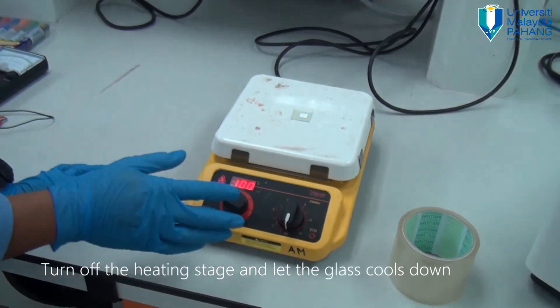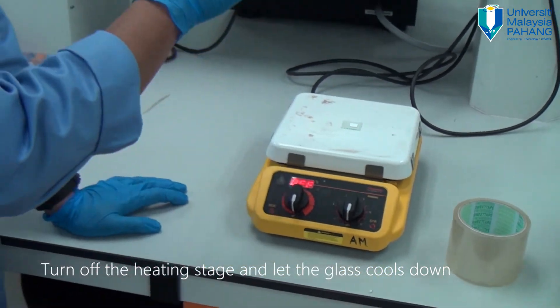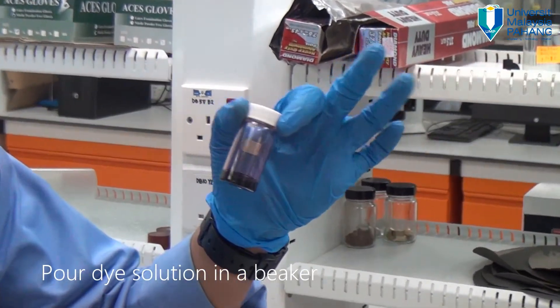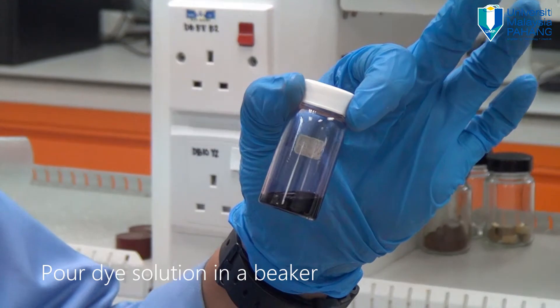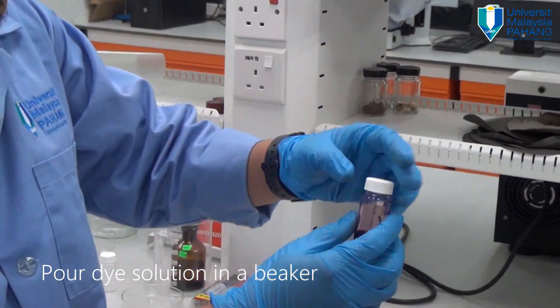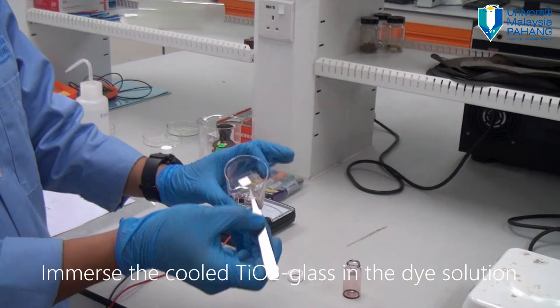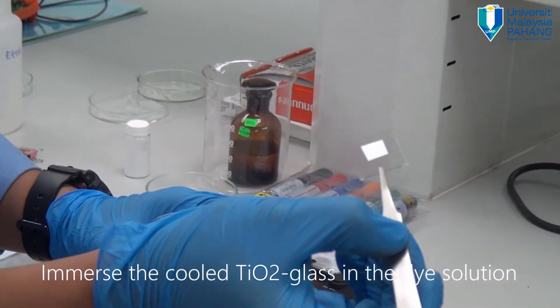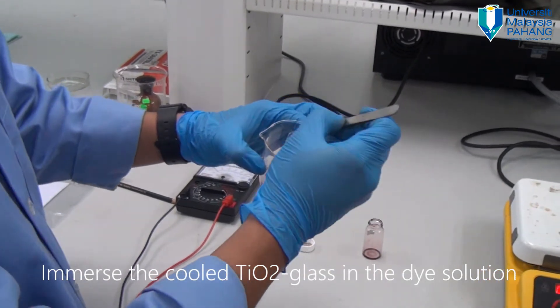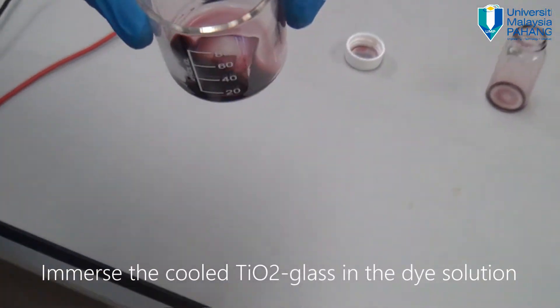After the titanium dioxide has reached 100 degrees Celsius for 10 minutes, turn off the heating stage and let the system cool down. The dye has been fabricated using red beet — you could use other fruits, leaves, or flowers to extract the dye by immersing them in ethanol. Pour the dye solution into a beaker and immerse your fabricated titanium dioxide layer into it. Make sure your layer has cooled down completely. Immerse it for about 10 minutes.